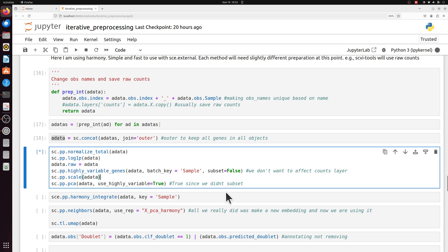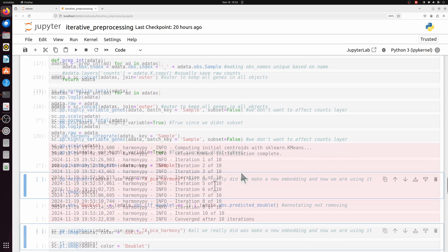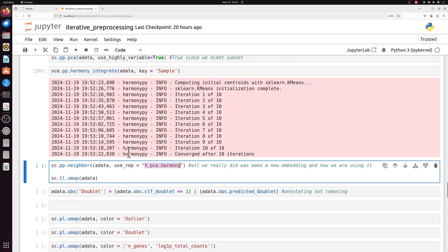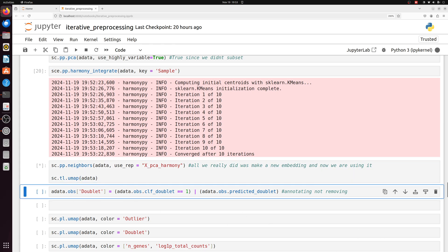And then after that, we can run harmony. Now we've created our harmony embedding, and we're going to use that to calculate the neighborhood graph and then get the UMAP.